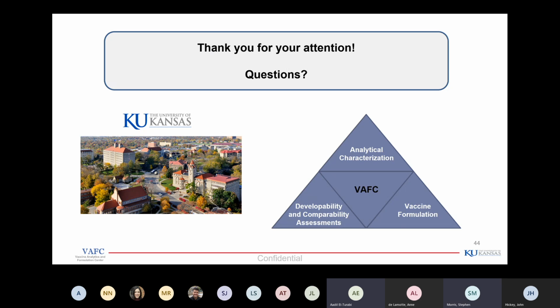But John, it occurs to me, mass spec sounds fantastic, but you had pretty clean and beautiful looking preparations of proteins. You talked about the different methods and the amounts of protein needed, but could you comment on purity and quality of preps?